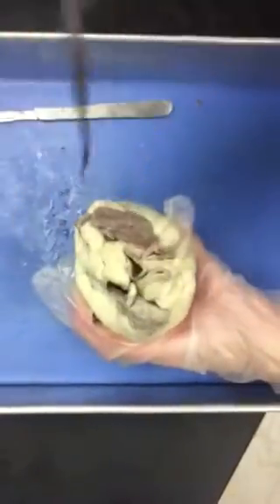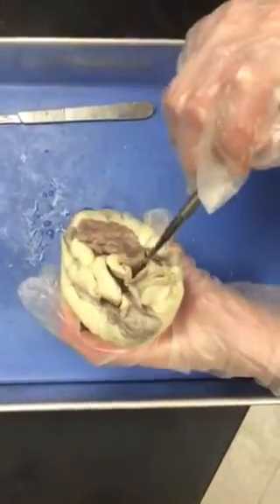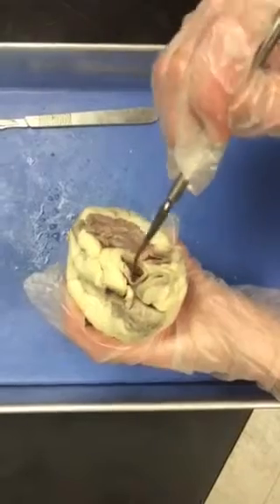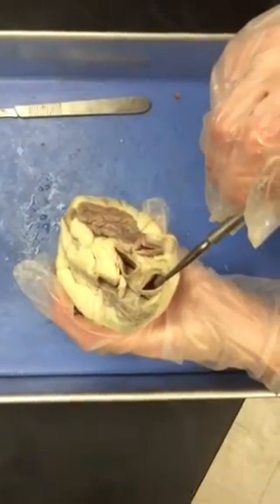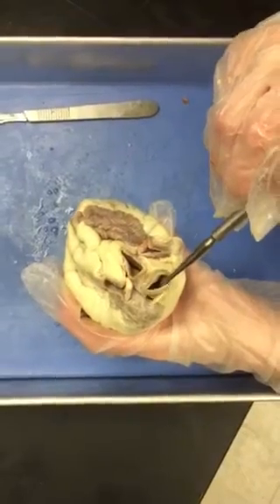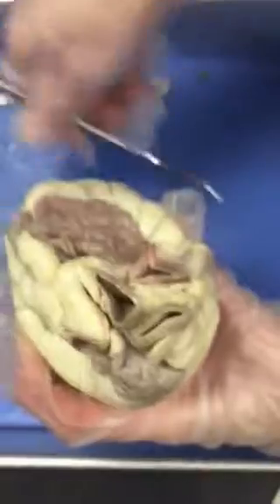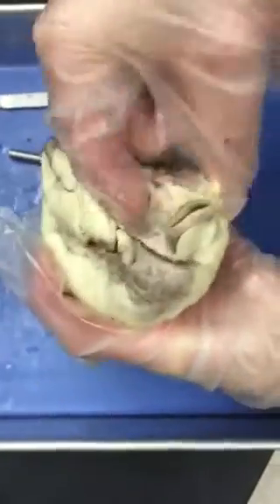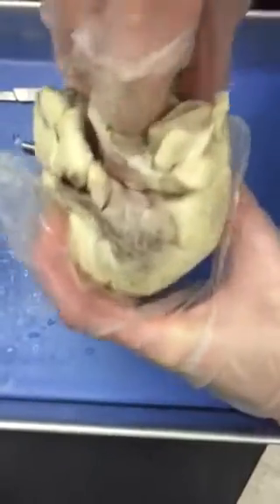19, next to the superior vena cava is the aorta, a large branching artery that leads to the left ventricle. The aorta has a branch called the brachiocephalic artery. It may seem to be a separate structure, but in fact is all part of the aorta. Place your finger or probe into it and see that it leads directly into the left ventricle. 20, in the space below, explain the function of the aorta.